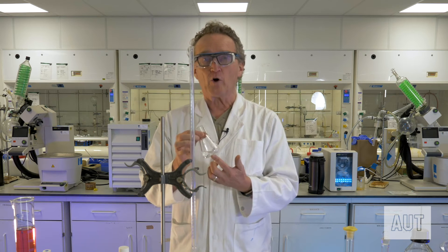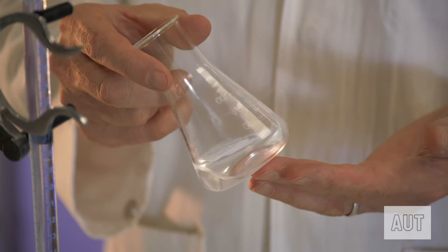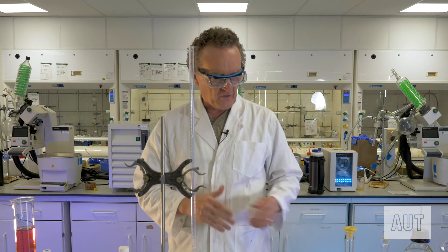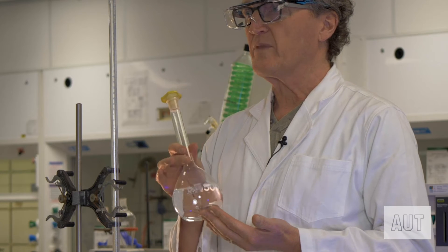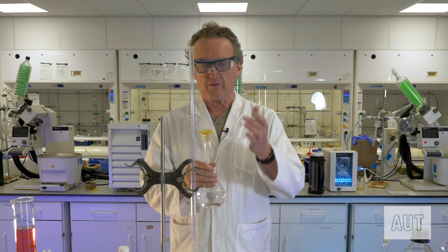In our Erlenmeyer flask here we've got 20 mils of our hydrochloric acid solution. This is the solution whose concentration we don't know. We are going to titrate in sodium hydroxide from our burette. Here is our sodium hydroxide solution — we know the concentration of this — and the first thing we need to do is fill up our burette with it.